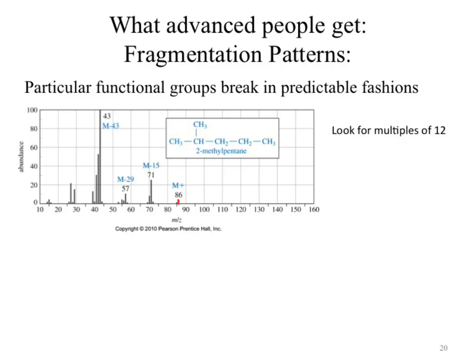After that, you'll notice there's a bunch of other peaks showing up. What are all those other peaks? Okay, it's the fragmentation pattern for the molecule. Remember, what we're doing is we're blowing up the molecule into a bunch of tiny little pieces. And so our detector is just going to count to see what pieces hit it. So you notice that we see these peaks every so often. In other places, we don't see anything. Okay, why? Because no compound of that molecular weight, or no piece of that molecular weight, came through.